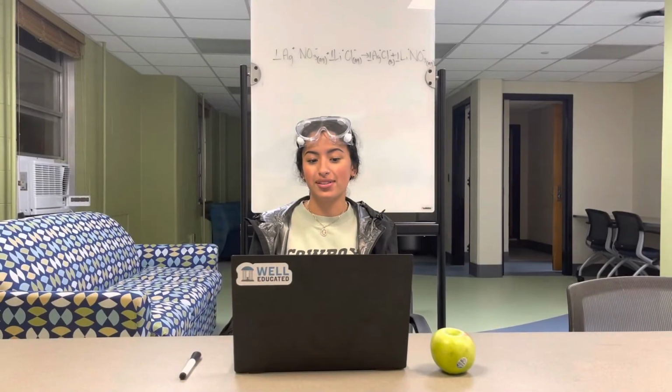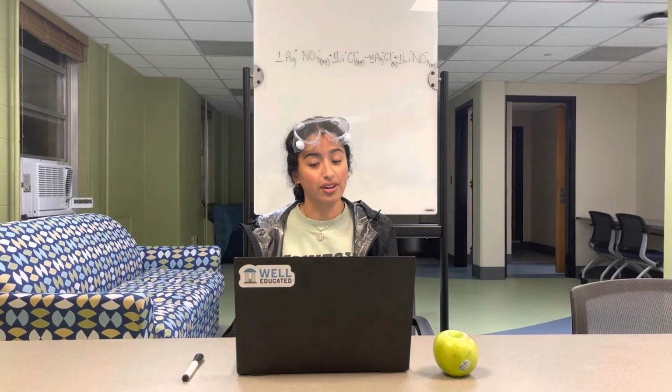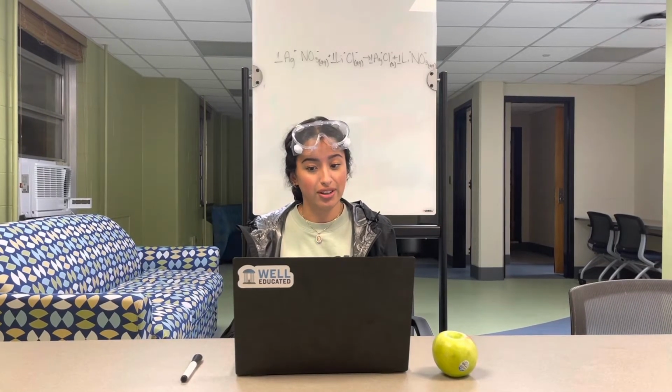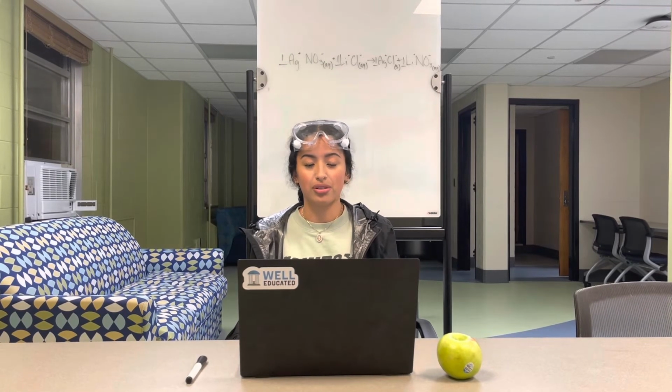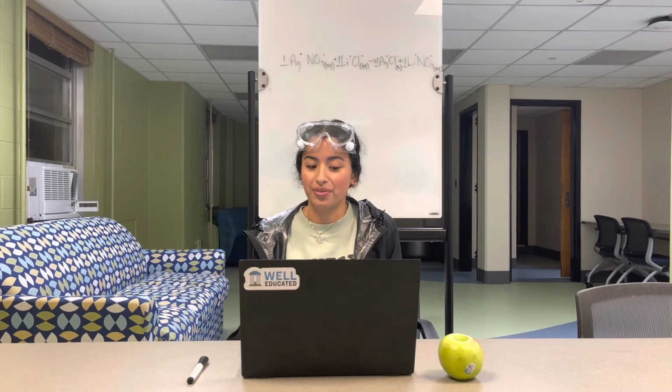One way to do this is with conductometric titrations, whereas the number of ions in the solution decreases or increases, the observed conductivity decreases or increases. Based on unknown and experimentally obtained values for moles of the reactants, the ratio of the reactants in the balanced equation can be determined. Finally, the equation is balanced to confirm the law of conservation of matter.